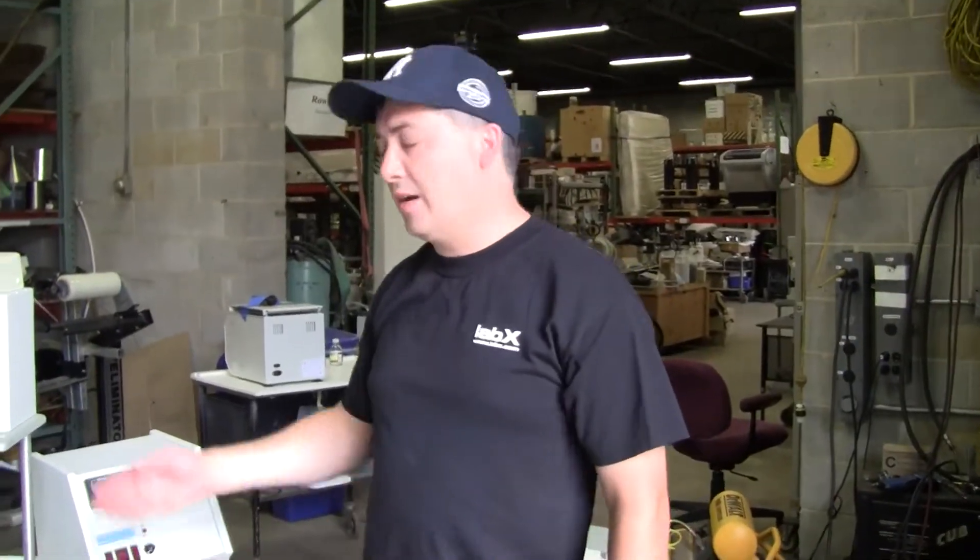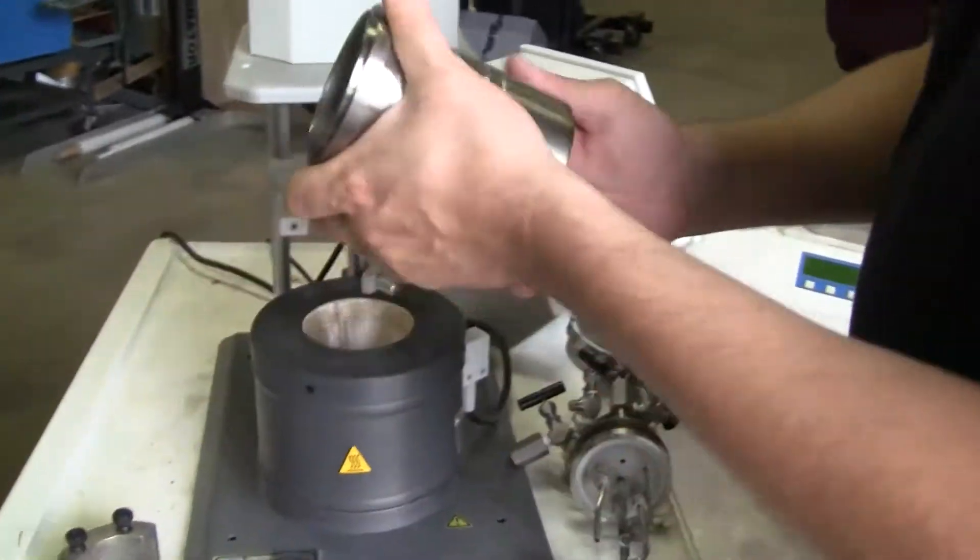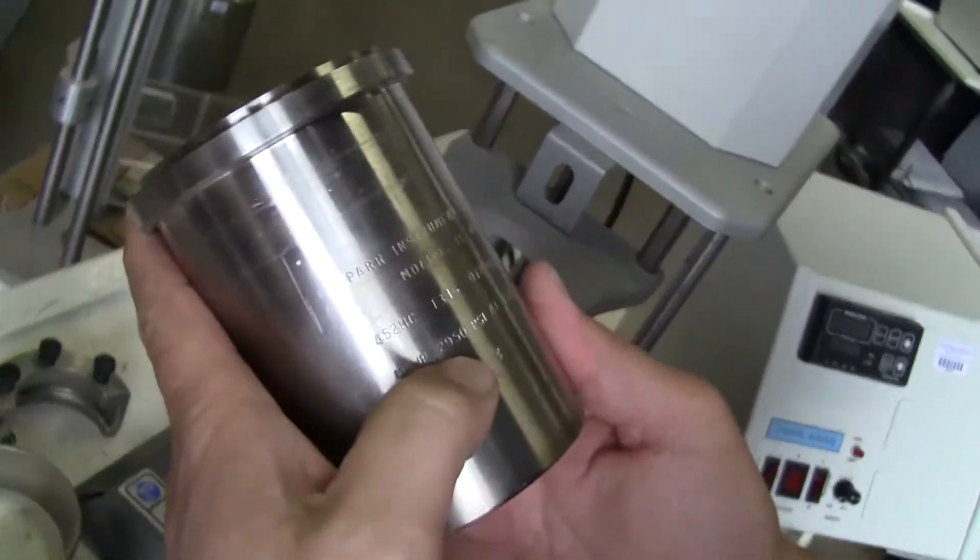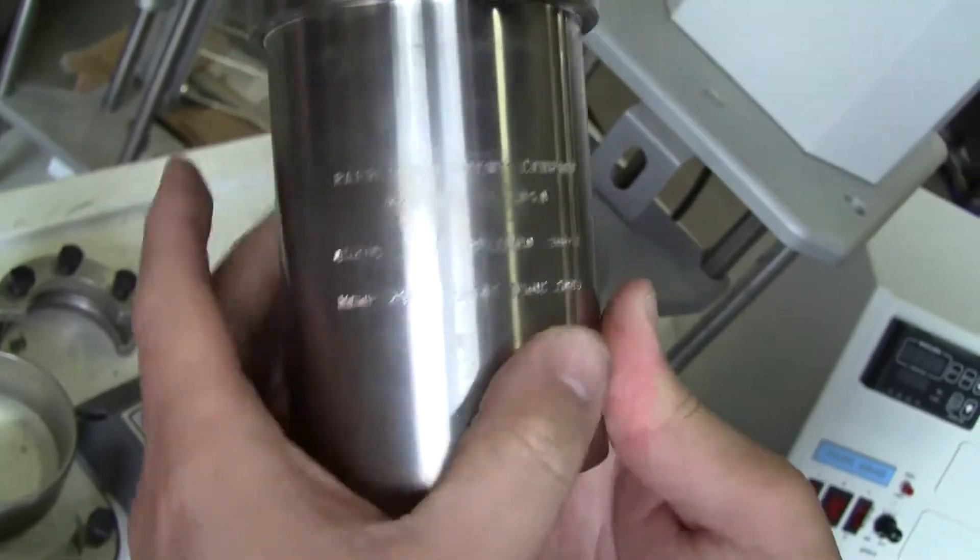Hi, this is Michael Natow from Hi-Tech Trader. Today we're looking at a PAR reactor. This little PAR reactor goes up to about 2,900 psi and at 350 degrees C.